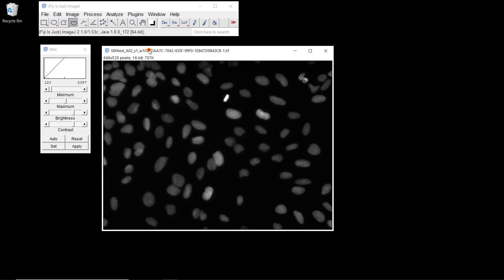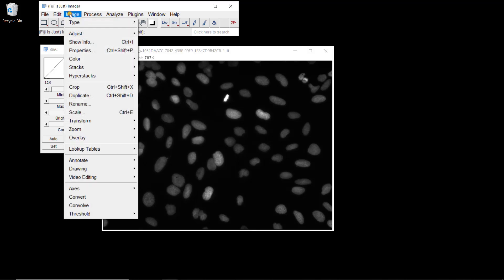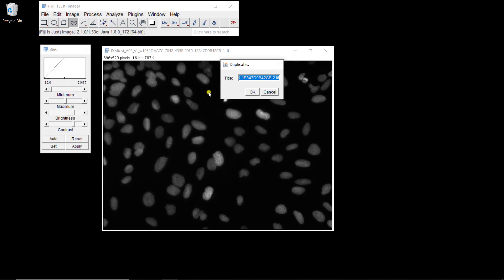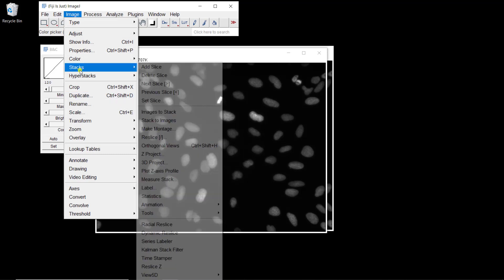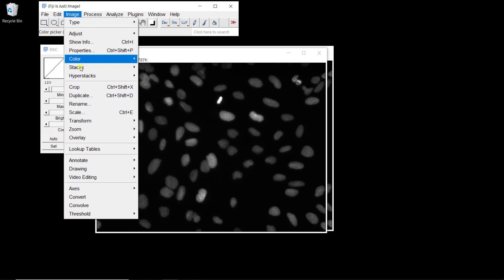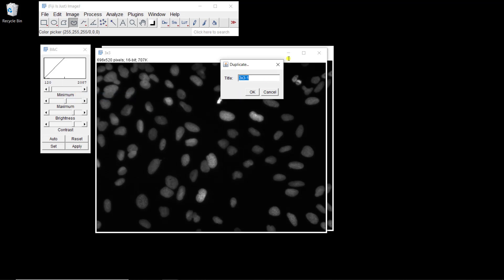I'm going to duplicate this image. Going to Image > Duplicate. I'm going to do a filtering with a size 3 by 3, and then duplicate this one again for a filter 7 by 7.